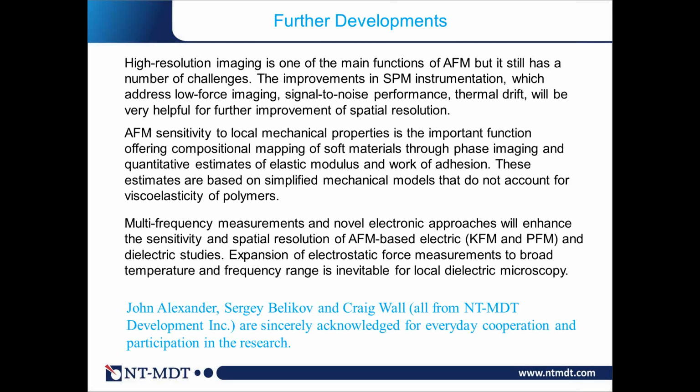Is it PeakForce or pulse force? Is it work with the force sensor, just published by the guys from Stanford? Or is it the harmonics approach? Anyway, what you're generally talking about is finding a way to extract mechanical force curves from any type of the mechanical AFM experiments, and then analyzing these force curves in terms of models taking into account the tip and so on. You're not escaping from doing this basic work.